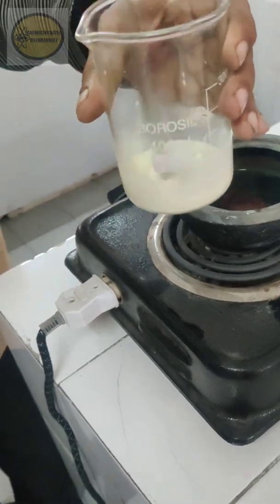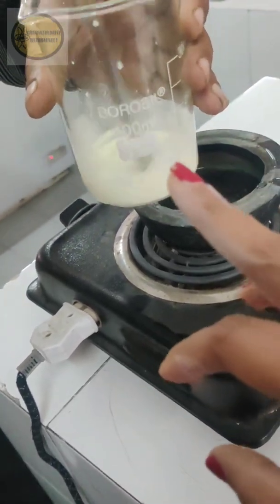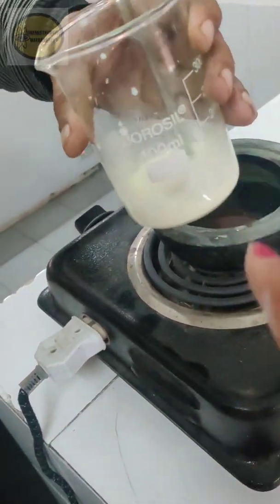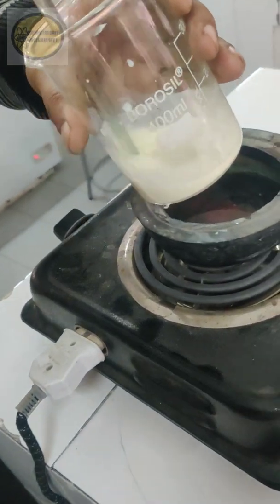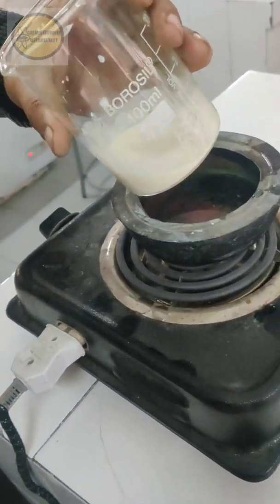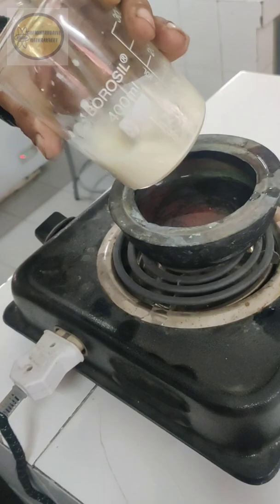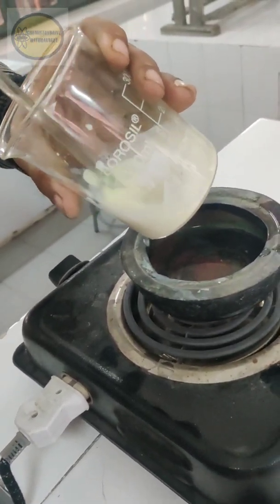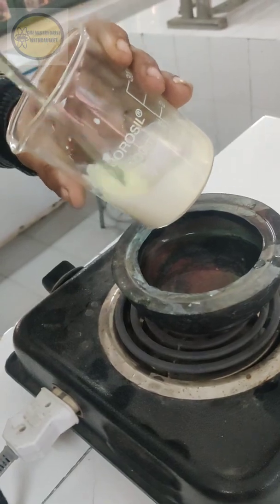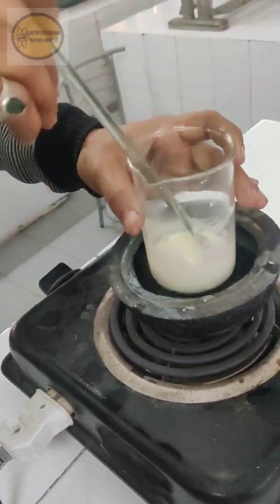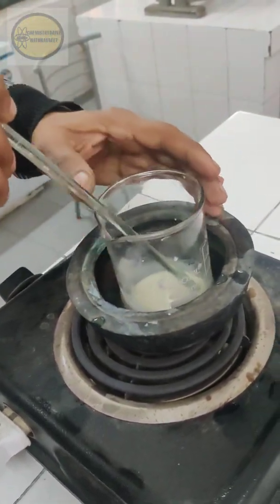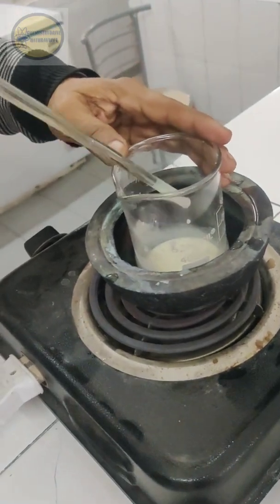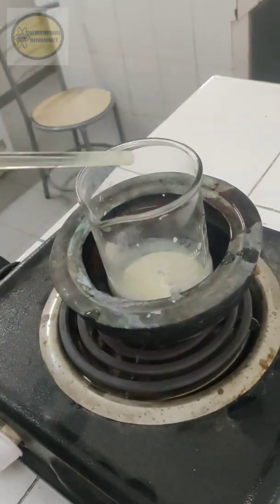Now for recrystallization what we have done is we have mixed our precipitate with the alcohol. So about 10 ml alcohol I have taken depending upon how much para-nitroacetanilide you have obtained. Like if you have obtained about 5 grams so you can put 20 ml of alcohol. So why we are using alcohol because ortho product it is soluble in alcohol so at the end we'll be left only with the para product.